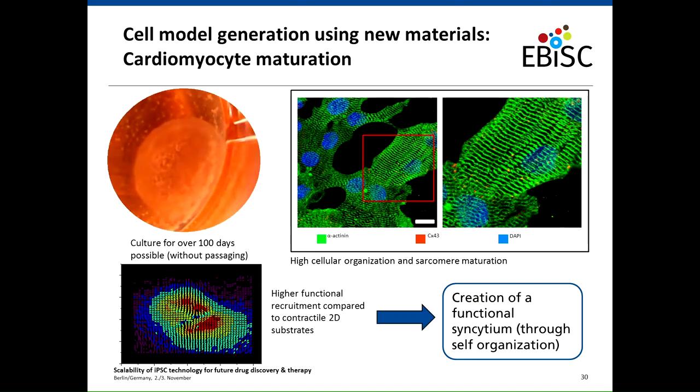Yeah, the point is that one of the advantages of the alginate is that there is one enzyme that only dissolves the alginate itself. That means with this, we can really dissociate the alginate microcarrier and have the iPS cells left over without using enzymes like trypsin or something like that, that detach the cell-cell contacts. So that is one possibility, but EDTA, the standard method, is also possible for detaching the cells, and the efficiency here is quite high.